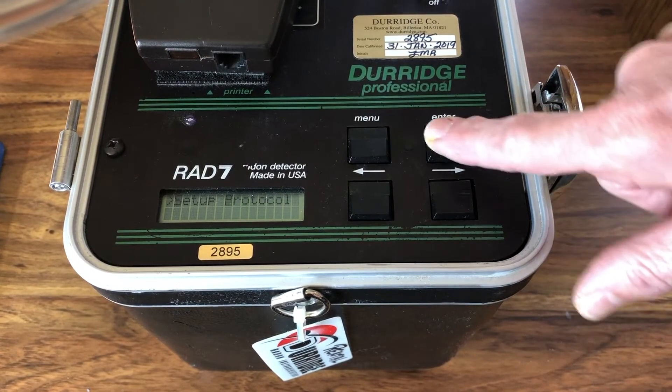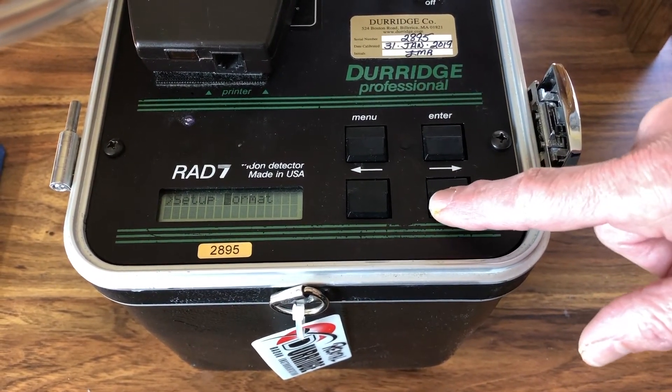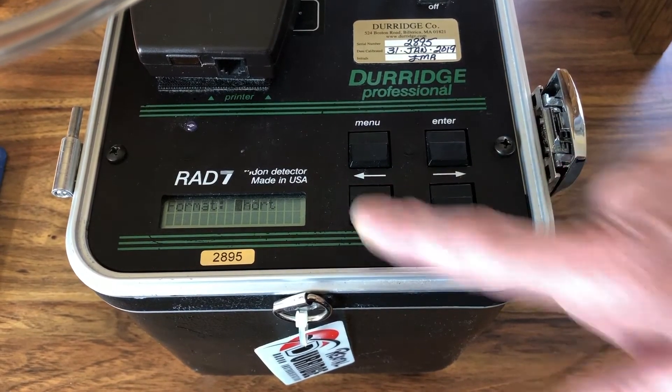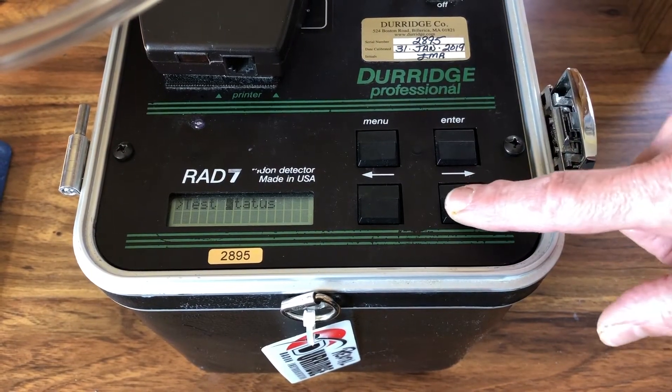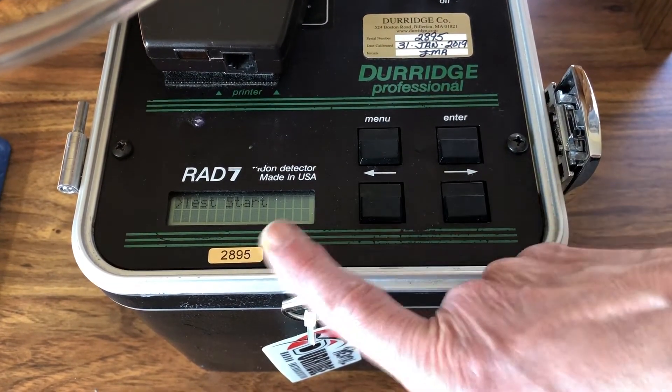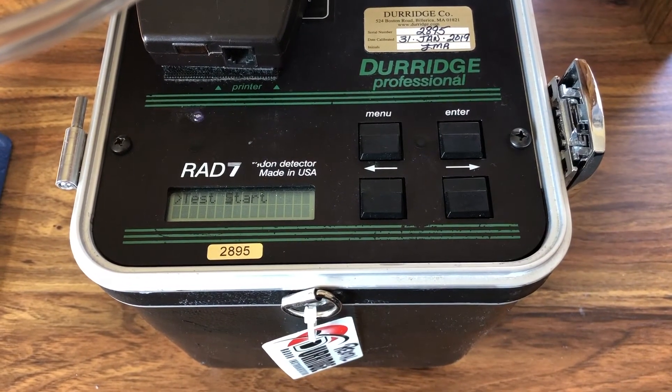In setup, you can set the format to what you want, but short would probably be just fine. Now it's ready. We're not going to hit enter yet, but we're ready to start once we have attached our bottle.